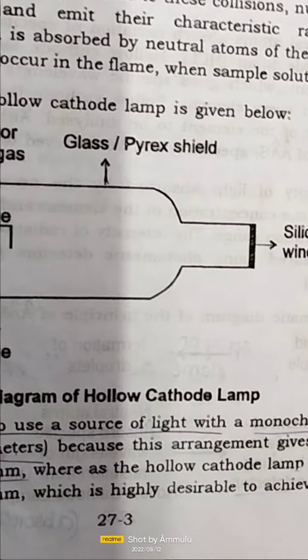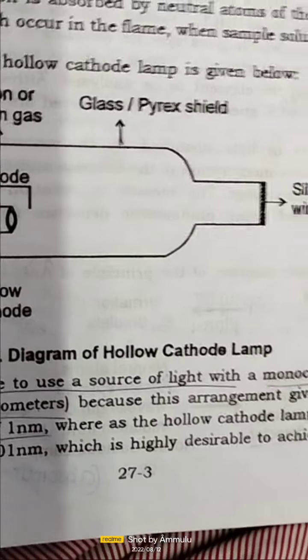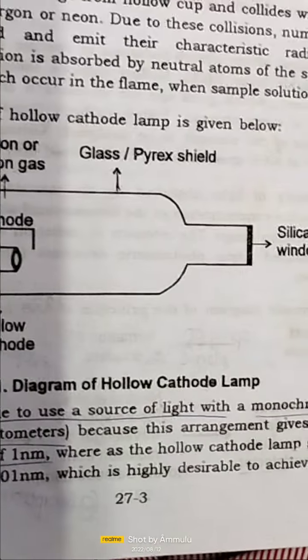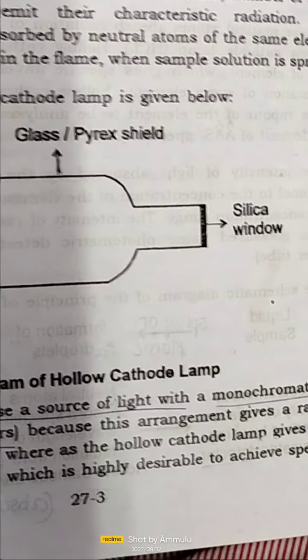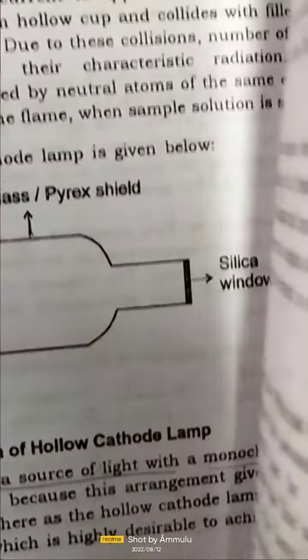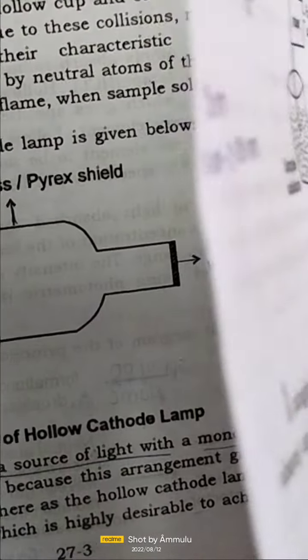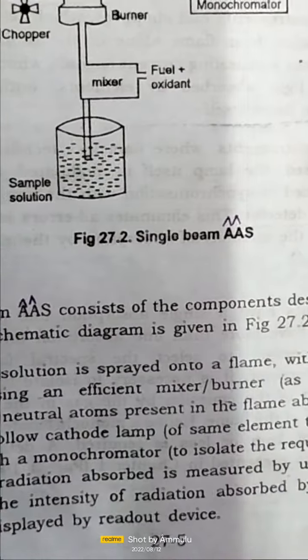The determination of every element needs a separate HCL. So it is a demerit of atomic absorption spectroscopy. Here the burner, hollow cathode lamp, chopper, monochromator, amplifier, detector, and readout device will be used.